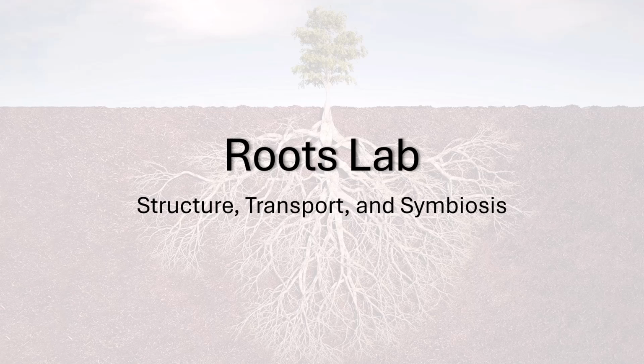In this lab, we're going to shift our focus from what's happening above ground to what's happening below ground, inside one of the most important and often most overlooked plant organs, the root. So far in this course, you've explored plant cells and tissues, and you've seen how those tissues are organized in stems and leaves for support, transport, and photosynthesis. Now we're going to look at how those same tissue systems are organized in roots to solve a very different set of problems, like anchoring the plant, absorbing water and minerals, and interacting with the soil environment.